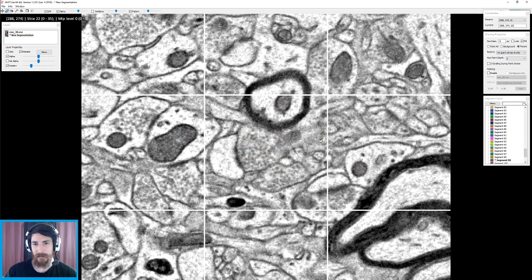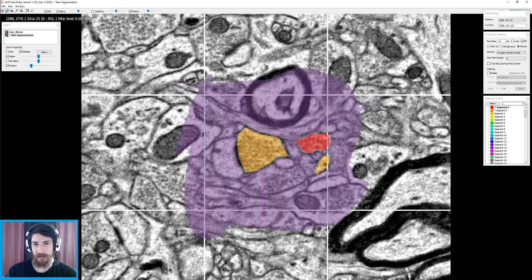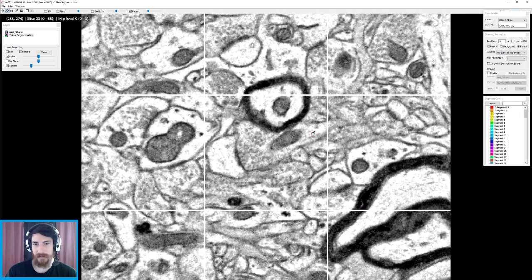What is this? What have I painted here? This is barely in existence.